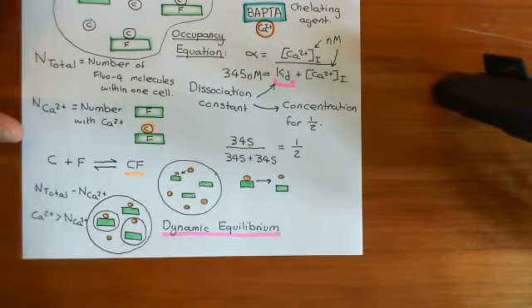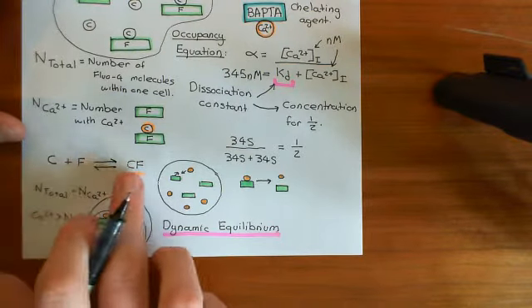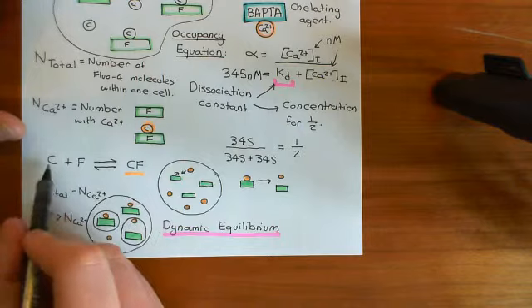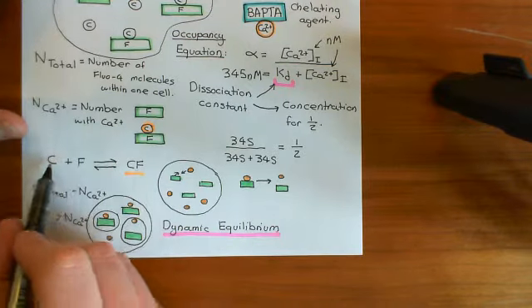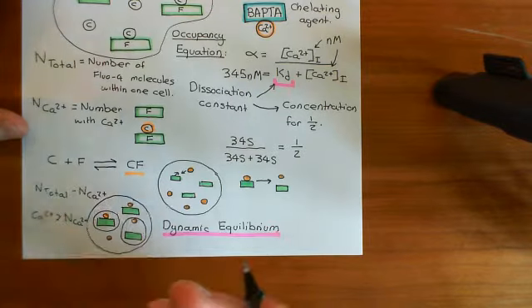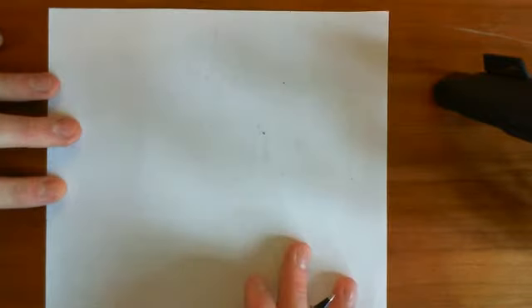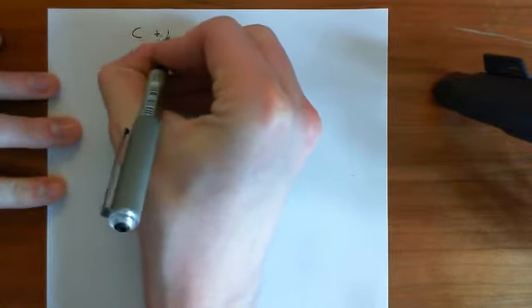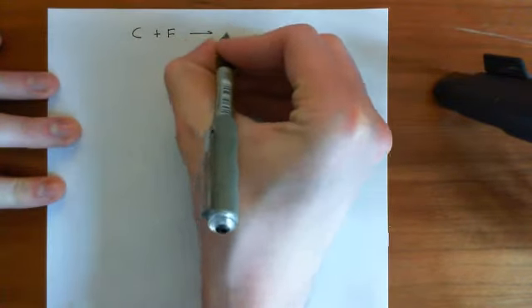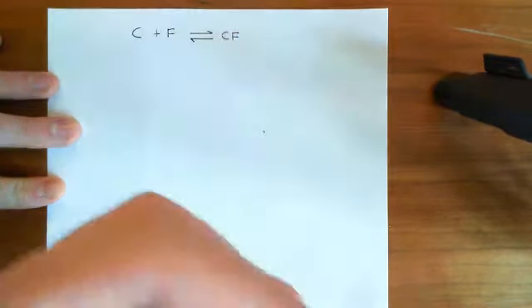Okay, right. So we can work out the concentration of calcium Fluo-4 complexes using the fact that this is going to obey an equilibrium equation. Okay, so I'm just going to go over onto the other page. Right, so at the moment we've got this relation where calcium ions can combine with Fluo-4 molecules to create calcium Fluo-4 complexes, and then those are going to dissociate back again.